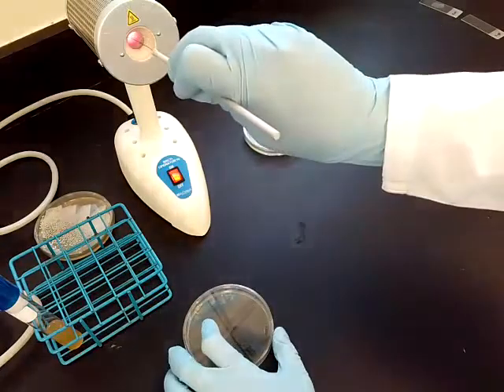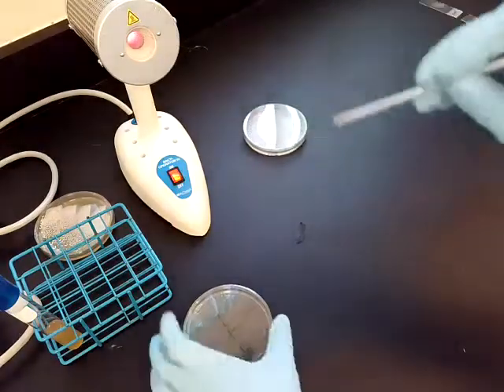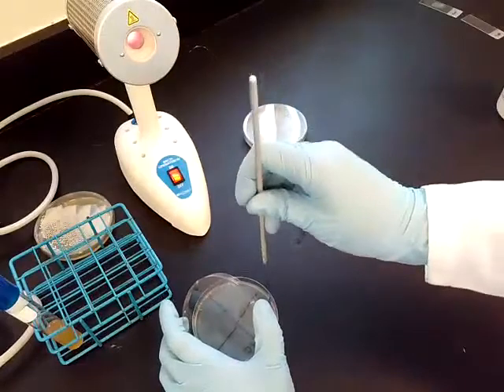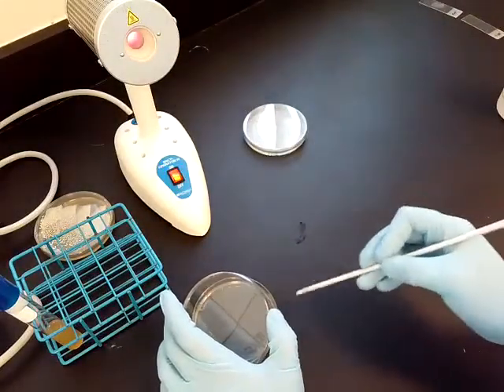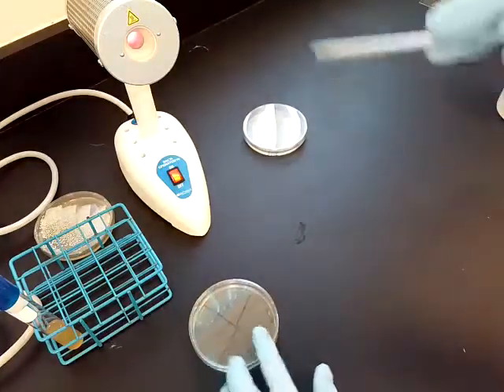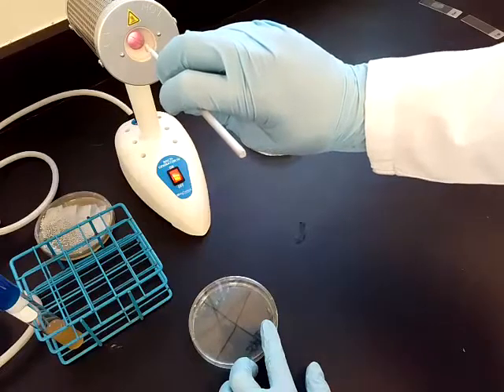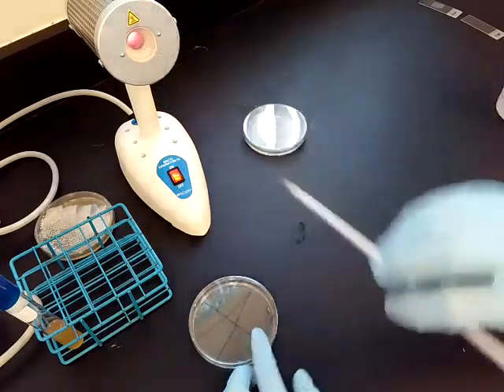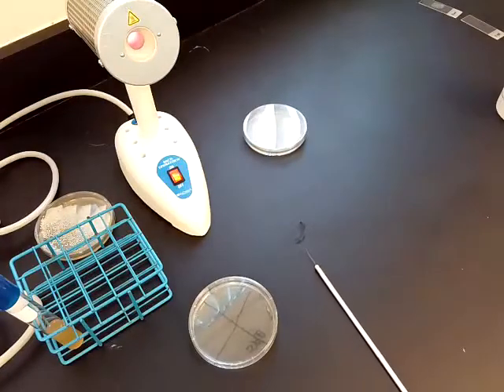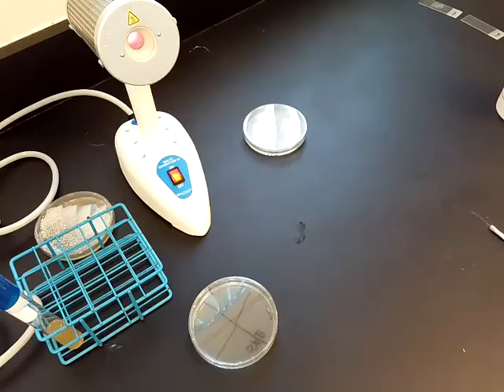rotate the plate again, and cool it off, and then from the third quadrant to the fourth. Again, the goal is to put some bacteria on the plate and then smear it thinner and thinner and thinner until we can have single cells landing on the plate. When that happens, those single cells are then going to grow into a larger cluster, a colony, and then we'll be able to evaluate that colony.